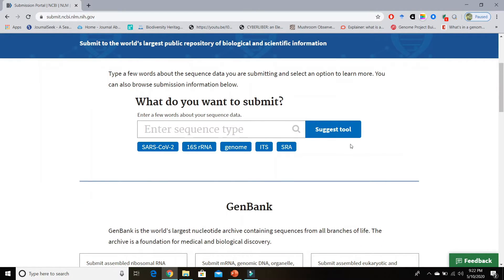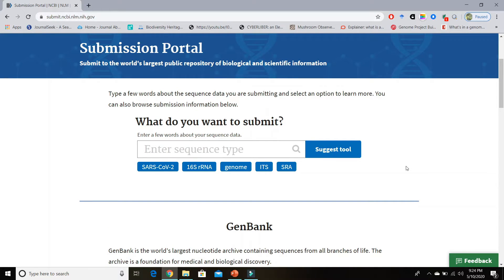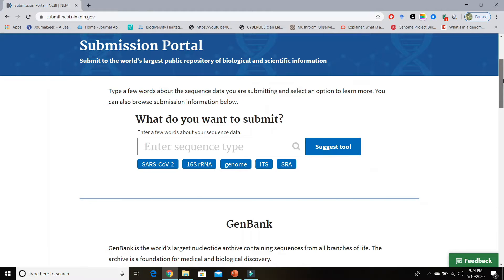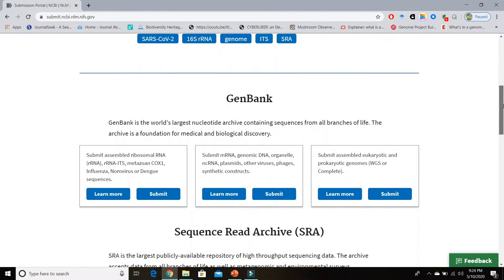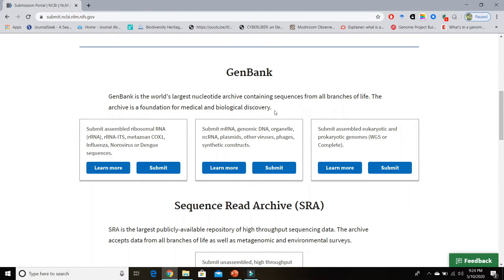First, let's talk about the suggest tool — when you type some words of your sequence data it will suggest the right tool to submit your data. However, if you are not an expert then leave it and let's try to select by manual search. Scroll down the page a little bit and here you can see all of the tools of GenBank you can use for your submission of sequence data.